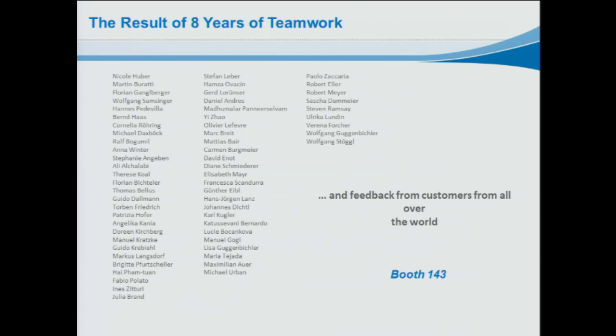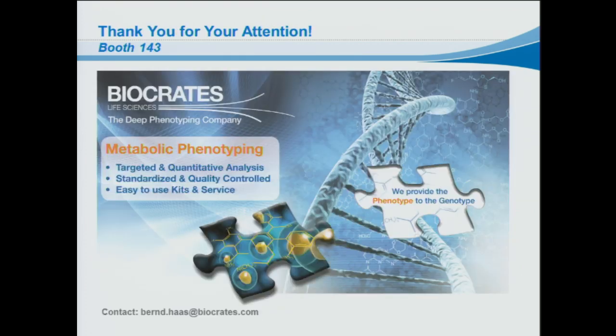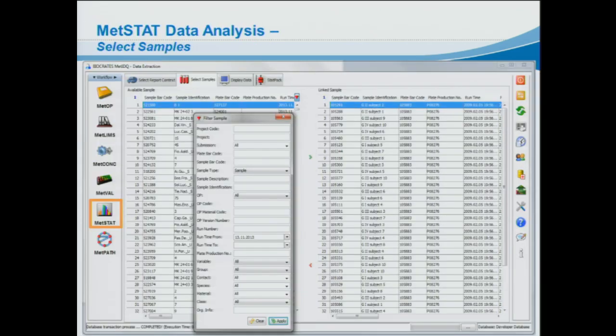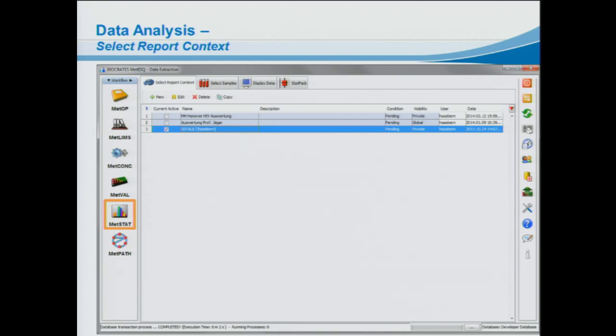Right along those points, we like your software, we use your products. They perform quite well. One thing I would like to see in the software is the ability to store workflows and the results of those workflows, so that you've taken a number of samples, run them through a statistical processing pipeline, and done an analysis. You can store the result from that workflow, but you can't capture the entire workflow, as far as I'm aware right now. Yes, this is what we now address with the feature I showed you here.